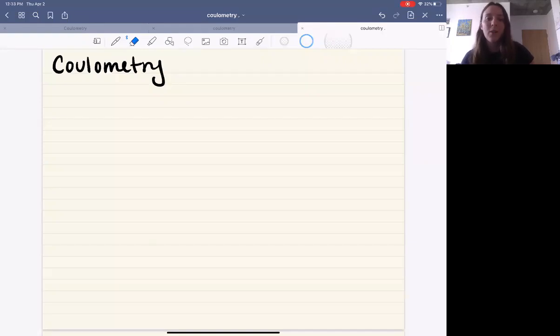Hi there. So the next property of seawater that we are going to investigate is the alkalinity. And to do that, we'll be doing a titration to determine the total amount of basic substances in the seawater. And typical to any titration reaction, we need to know the concentration of the titrant in order to solve for the unknown, which is the analyte concentration.